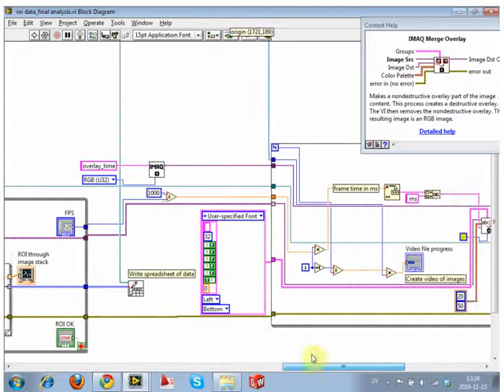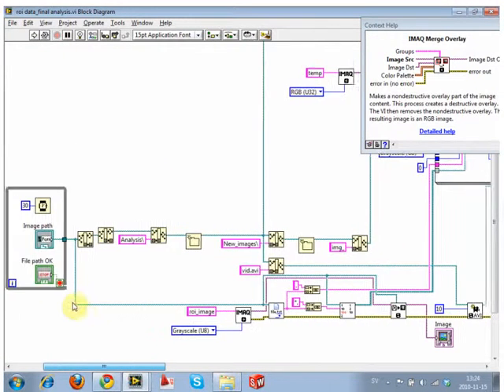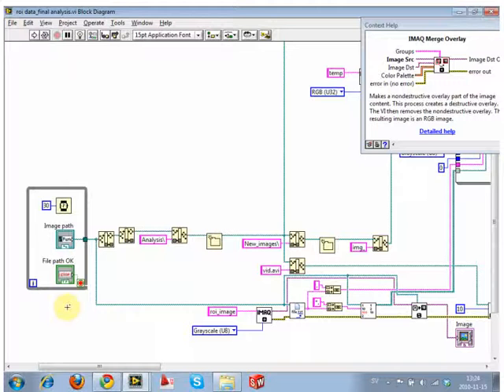And this is a lot to take in. Luckily, we've done most of it before. What we're going to start off by doing is really just digging down and looking at how we separate out files.